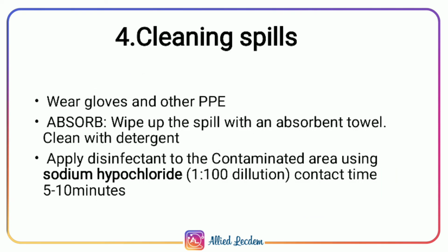Cleaning spills. Before cleaning spills, we should wear gloves and other personal protective equipment. Absorb: wipe up the spill with an absorbent towel, clean with detergent. Apply disinfectant to the contaminated area using sodium hypochlorite. Sodium hypochlorite is the most important disinfectant for cleaning the contaminated area. Dilution is 1:100 and the contact time is 5 to 10 minutes.